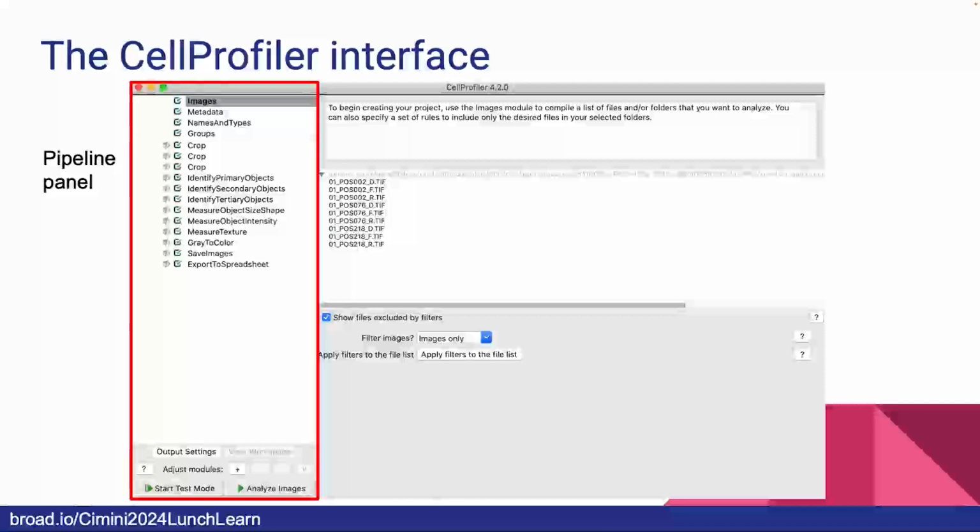In fact, it will even, unless you turn it off, write a copy of the pipeline into your quantitative measurements so that you know right next to the measurements exactly how these measurements were created. Please don't turn that off. People do, but please don't.